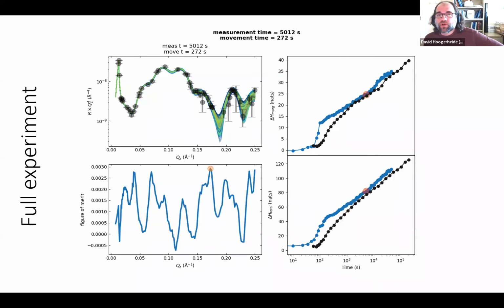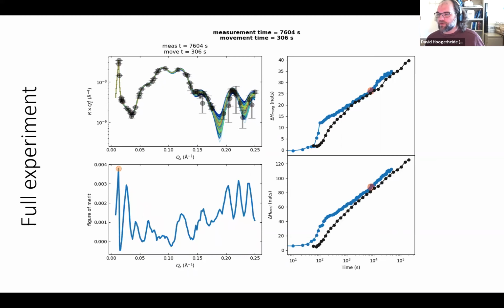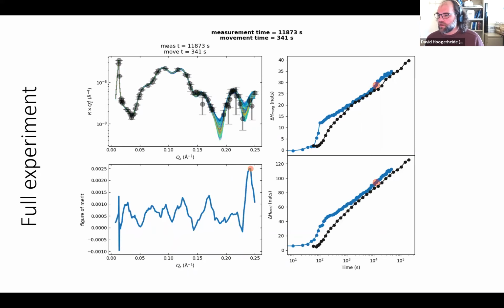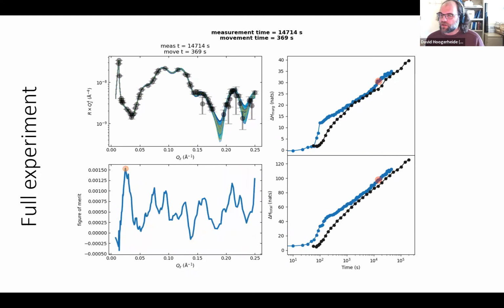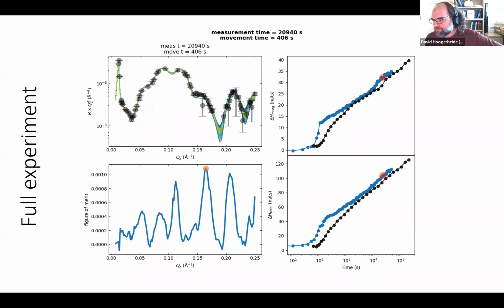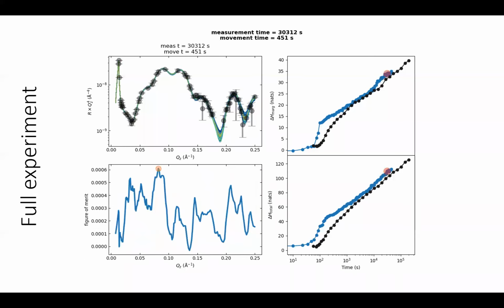Or you could take a low statistics scan through your whole curve, so that you've mapped out the whole thing and don't have any surprises, and then turn on the autonomous measurement. It will have a good starting point because you will have measured something about the whole curve. In fact, when I was first doing these simulations, that's what I did. It turns out you don't have to, but you can. Okay, thanks.